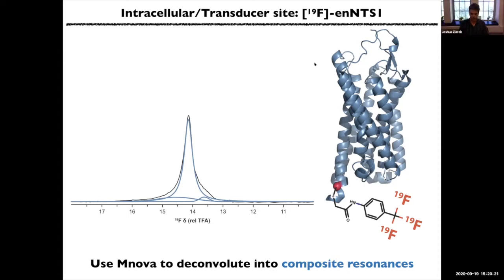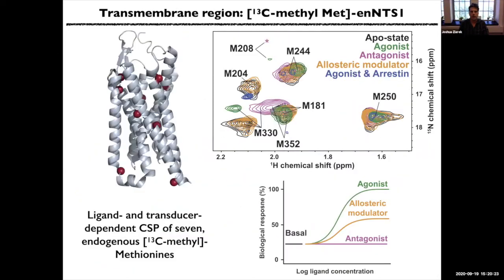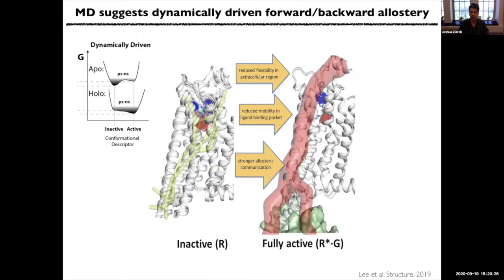Yeah, I mean that's what the MD simulations kind of suggest a little bit, is that they do see basically a correlated change in side chain dynamics that goes through the transmembrane region of the receptor. So what they're trying to illustrate, at least here, is if they look for correlations of dynamics through that transmembrane region, on the left of this figure, in the absence of a transducer molecule, they see multiple different pathways that seem to have very subtle correlations to them.